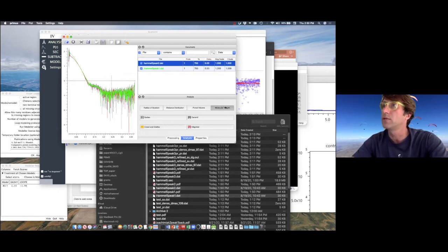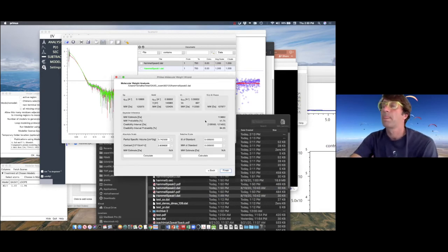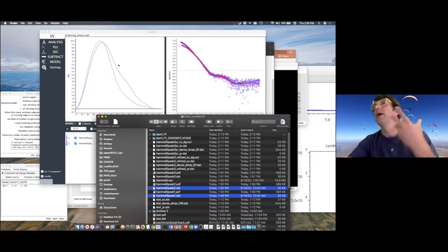What about peak 2? That's the smaller particle. Next. So it's 110 kilodalton right here. A very fast way, but look at those. You confirm that the MALS molecular weights are right, and the SAXS basically confirms the molecular weight that we see in the MALS.